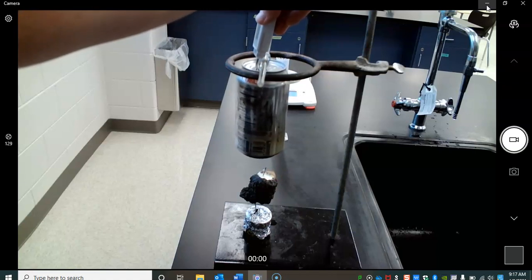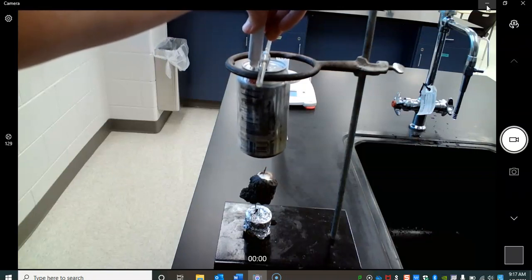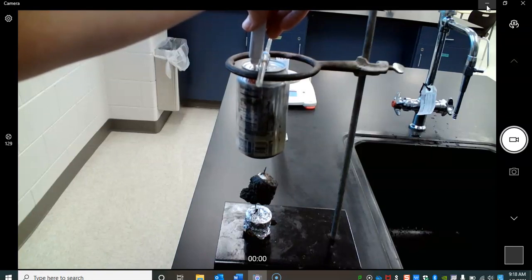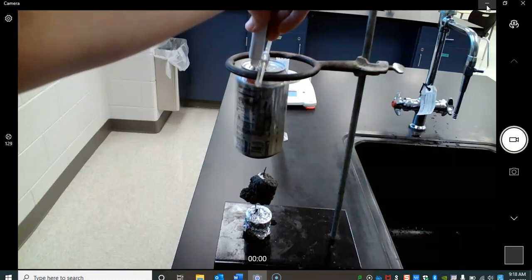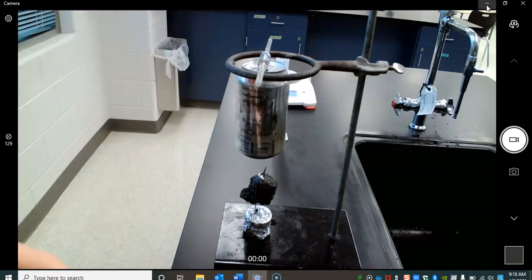All right, so we're still climbing. I saw 34.7. Oh, it seems to already be going down quite a lot. So I think the highest temperature I might have observed is 34.7. But let's wait and see. Oh, now it's climbing again. 35, 35.1, 35.4, 35.5. All right, so it looks like the highest temperature here is 35.5.